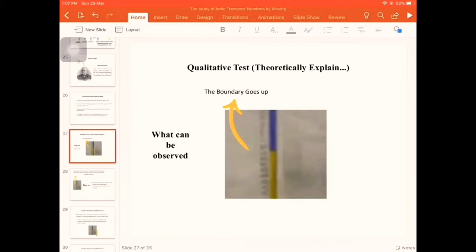The motion of the ion is observed immediately. This mobility of the ion is said to be influenced by the applied potential. The transference number of the H+ ion is determined to show that the motion of the ion occurred during the electrolysis cell, and anions and cations are carried by the current. So the amount carried by each is directly proportional to its speed. So you can see the movements.